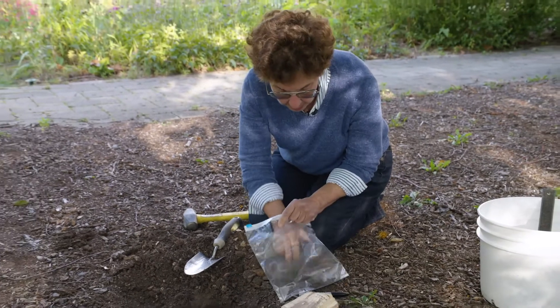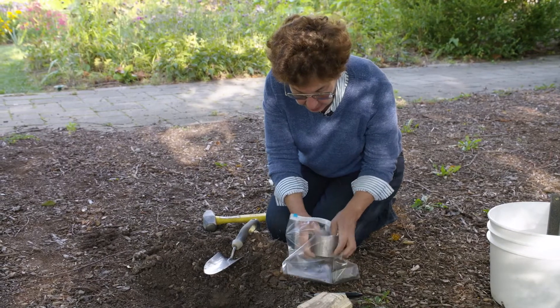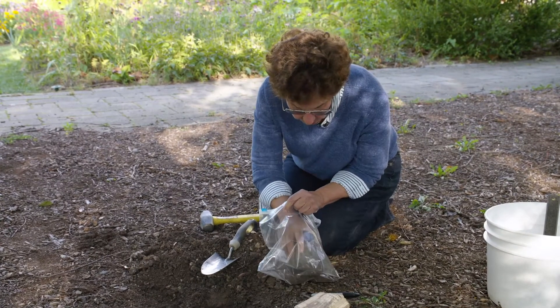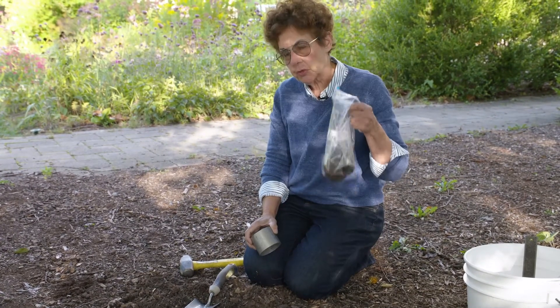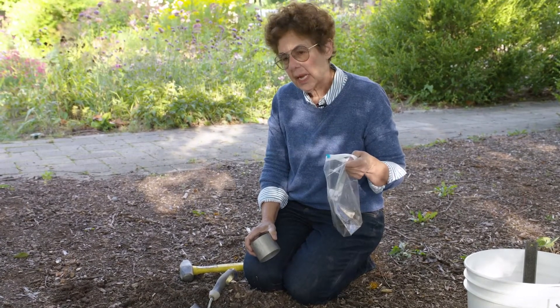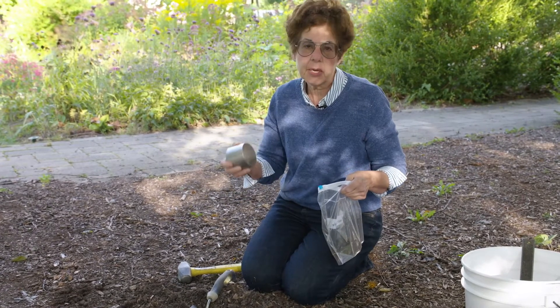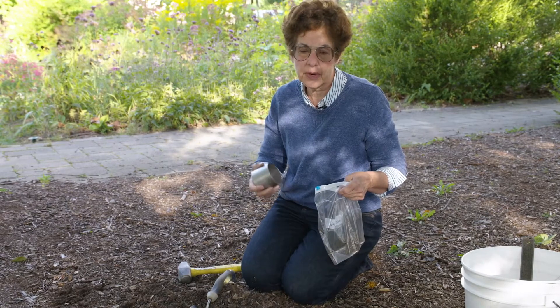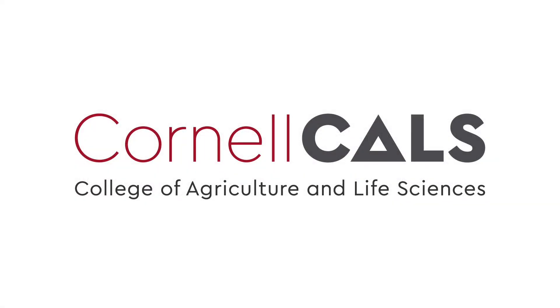We allow that soil to get out into the bag. Now we have a known volume in a bag. We'll dry this soil, and the dry weight per volume gives us the bulk density. It's a measure of compaction of the soil, very useful when you're doing soil testing. This has been a production of Cornell University, on the web at cornell.edu.